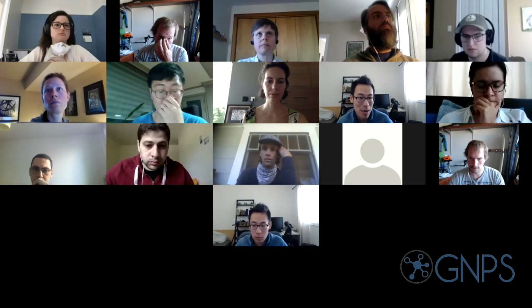You can merge it, and it probably just simplifies things. But maybe the better way is to just pick one quant out of the set of different adducts as opposed to actually doing an addition. So it's one of those things. Are you saying you would only retain the M plus H's for everything? You could. That's one option for simplicity's sake.